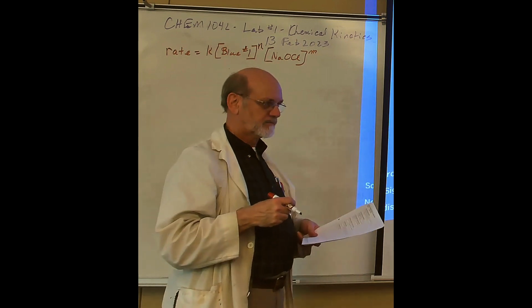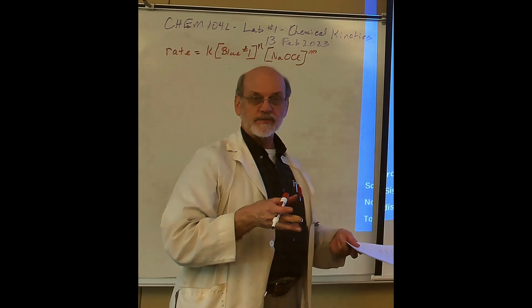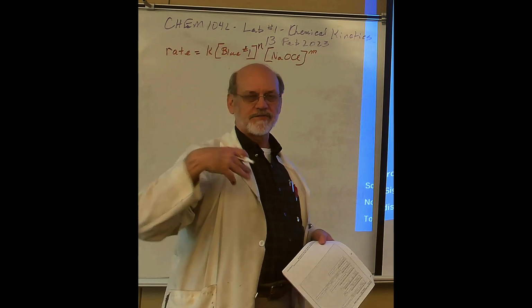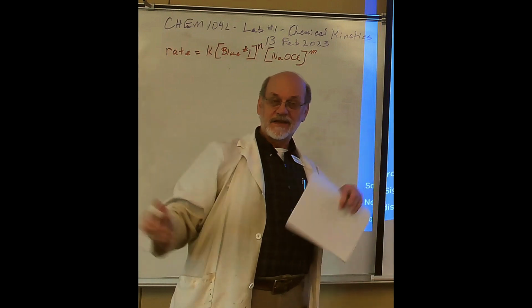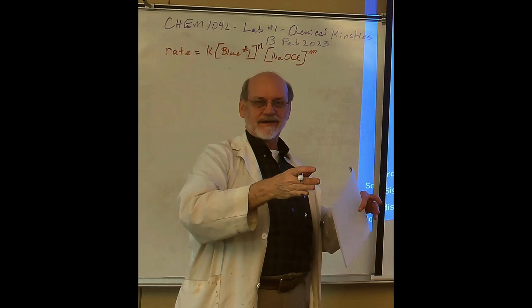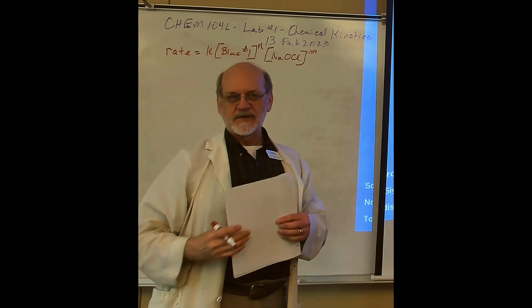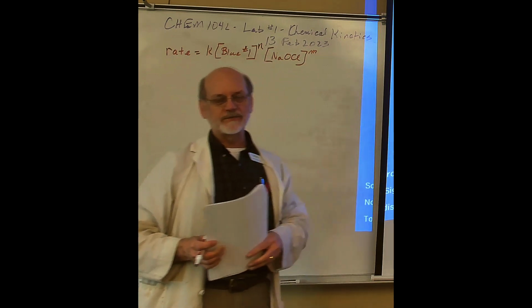But I say, start off with, say, 6 drops or 4 drops and get that data, then I'd jump it up to like 16 drops or 30 drops, and start bracketing it in. And if you put in like 40 drops and it's way too fast, then cut it back. You can get there quicker by iteration than you can by slogging through each 2 drops. That's what I tell my class to do.